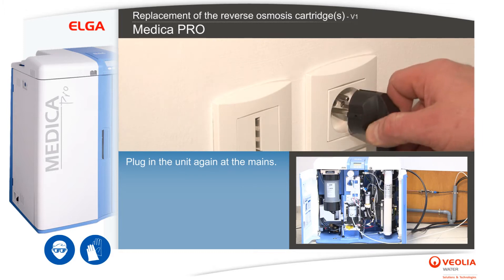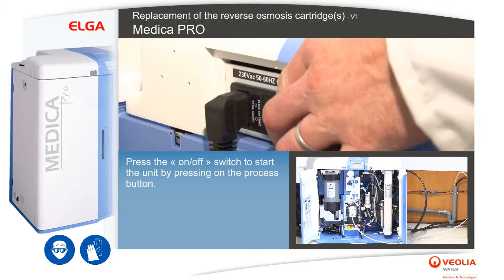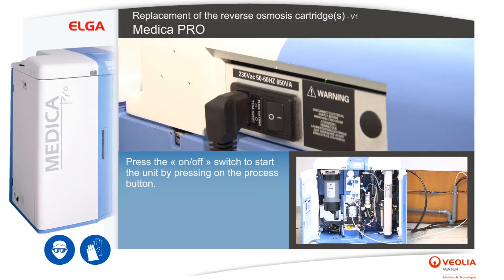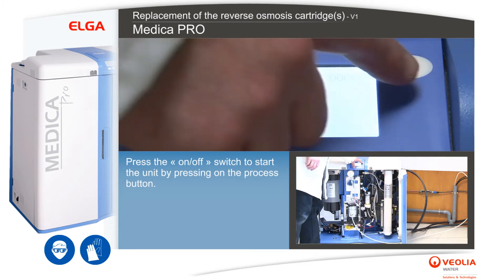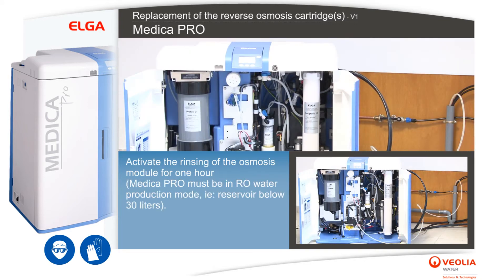Re-insert the LC174 pack. Plug in the unit again at the mains. Press the on/off switch to start the unit by pressing on the process button. Activate the rinsing of the osmosis module for one hour. Medica Pro must be in RO water production mode, i.e. reservoir below 30 litres.